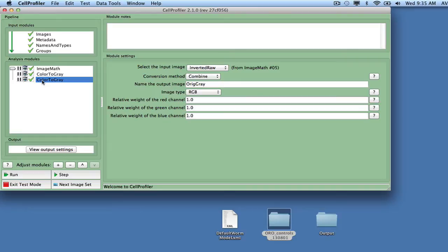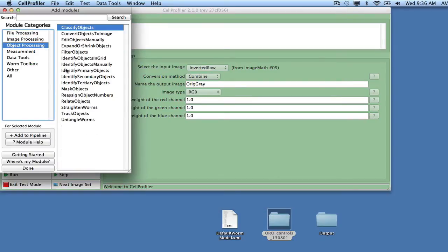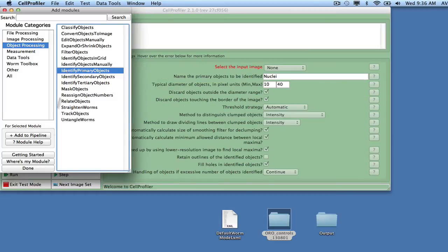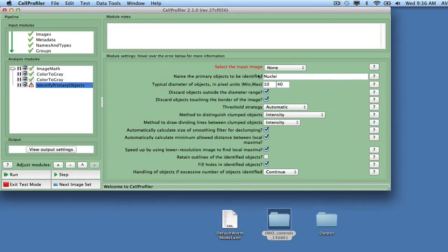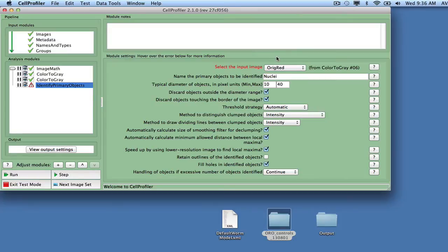The same is true for the edges of the wells visible in the corners of the image. We can detect both of these structures in the Ridge Red image using the Identify Primary Objects module, using a manual intensity threshold of 0.5 and allowing a size range from 10 pixels to 10,000 pixels.